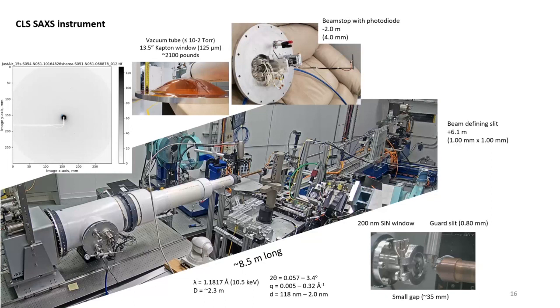I don't know if we'll ever go in that direction, but if you wanted to go to a higher Q, well, an intermediate kind of Q, we'd put the detector at a closer position. But that's the limit right now. So, yeah.